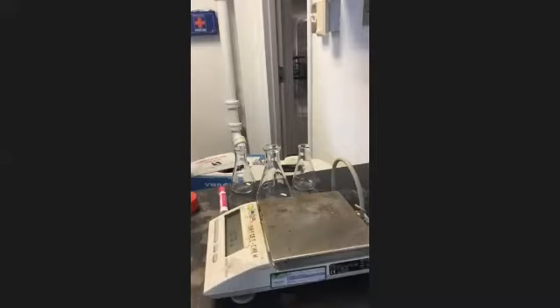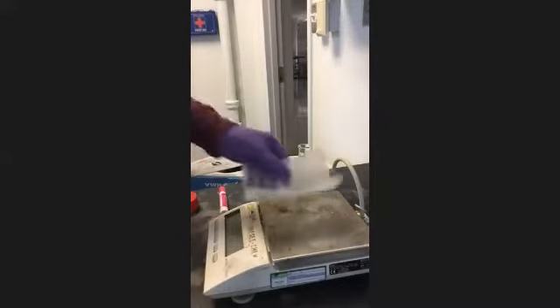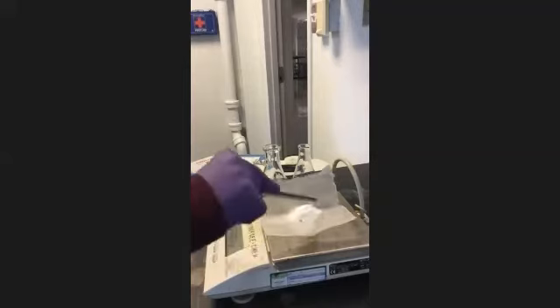All right, so for those of you who are watching again, you want to take that salicylic acid and deposit it directly into the Erlenmeyer flask. All right, and then one other thing, yeah, you're not, but that's okay. I said 1 through 5. I try to be explicit with my directions. She's a representative for 4.